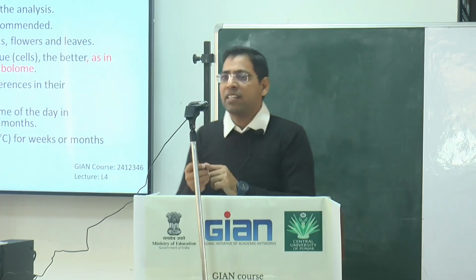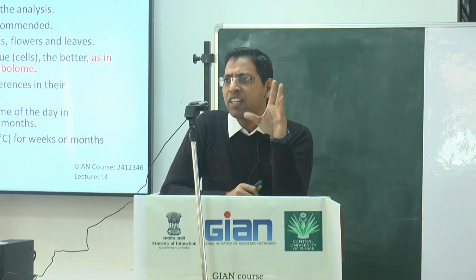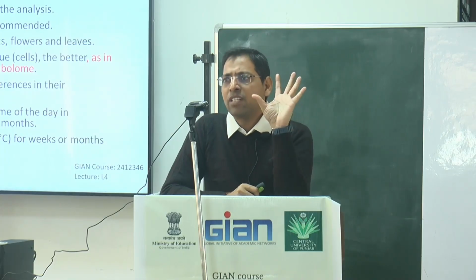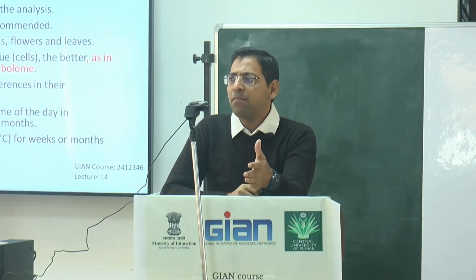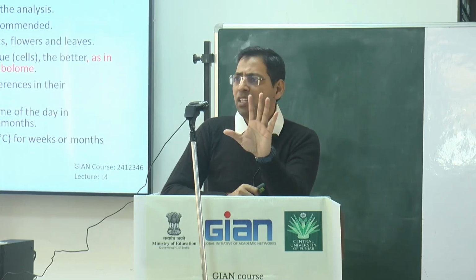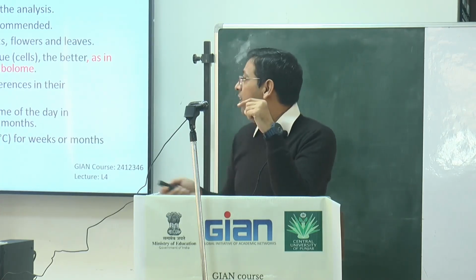Another point is that whatever sample you store today, you have to use within 10 to 15 days. If you think you will use it next year, your biological information is already lost. And remember, you have to collect the sample in liquid nitrogen. Liquid nitrogen freezes the sample at the same time, and now you are able to grind your sample. So those things are happening here.